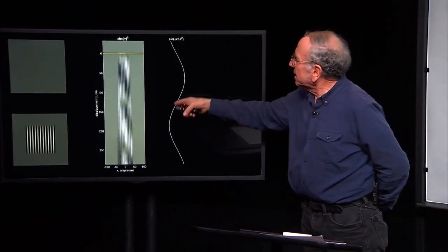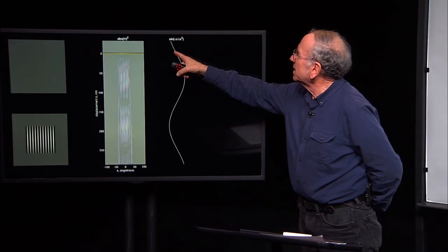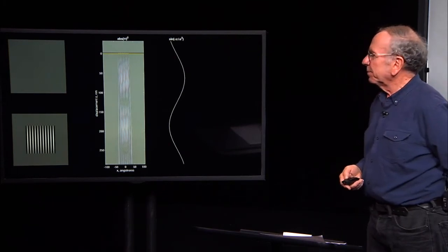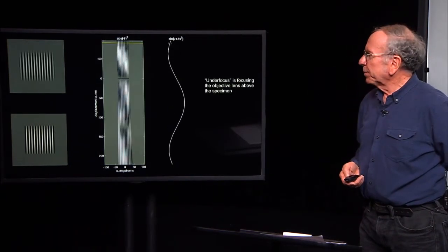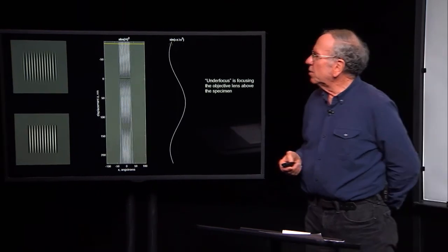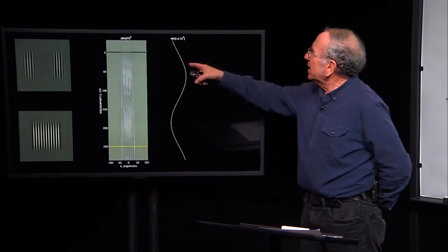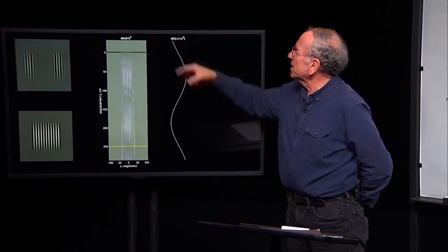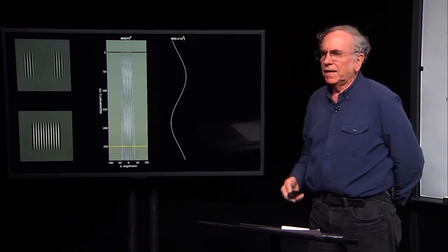And this is my contrast transfer function. This is the sine function at 0 here. It's a maximum here. It's a maximum negative value back to 0. This is, of course, a rendering of the original phase specimen grating at 5 angstroms. Now, what are we going to do if we focus the microscope above the specimen? We can see the issue here. If I just extrapolate this sine function, this contrast transfer, to negative values of z, that is values above the specimen, what's going to happen?